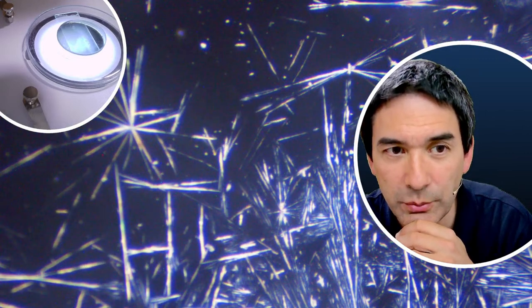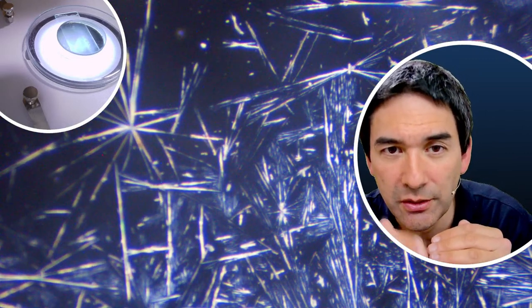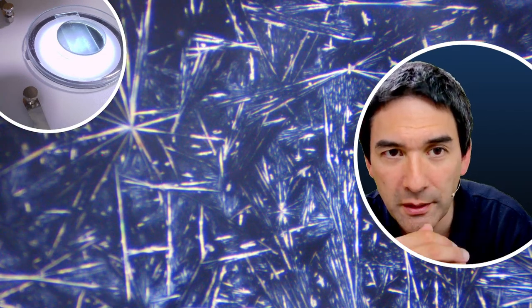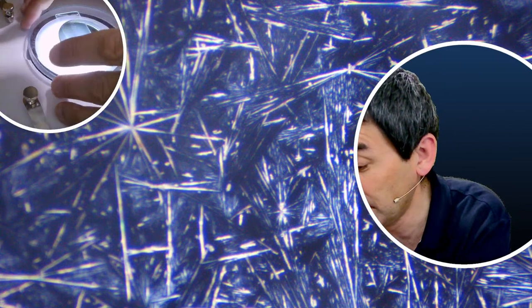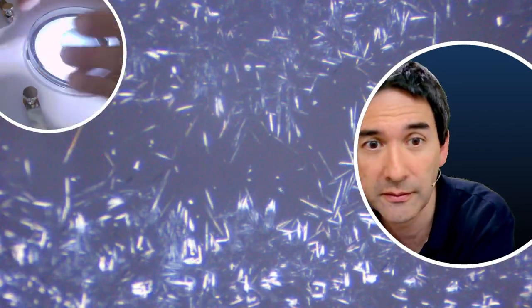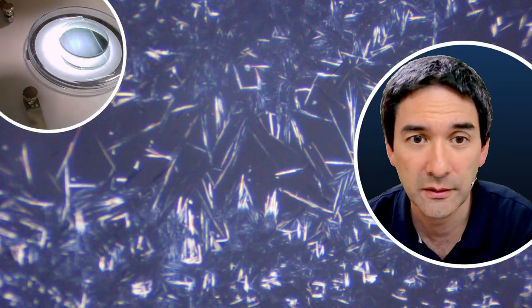It's the camera. The latency of the camera is so low. Do you see? That's why it looks kind of choppy. But this is how fast it goes. The whole slide is already almost done. So.